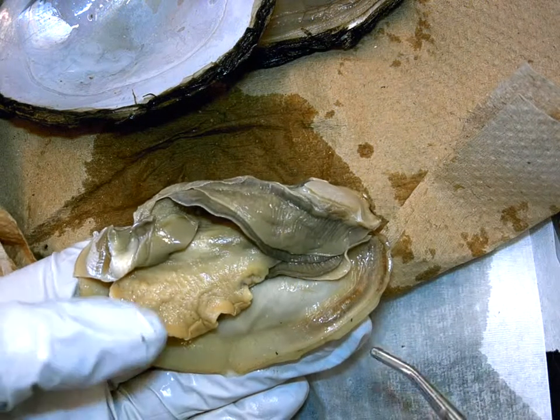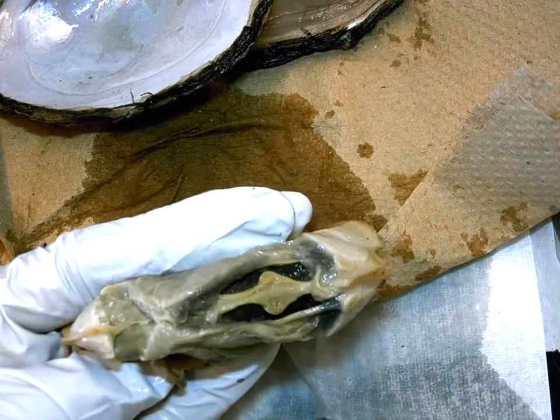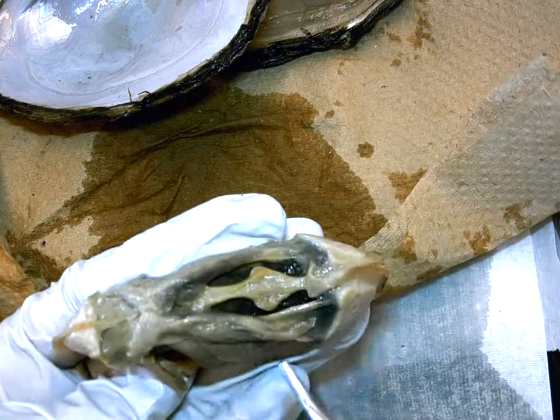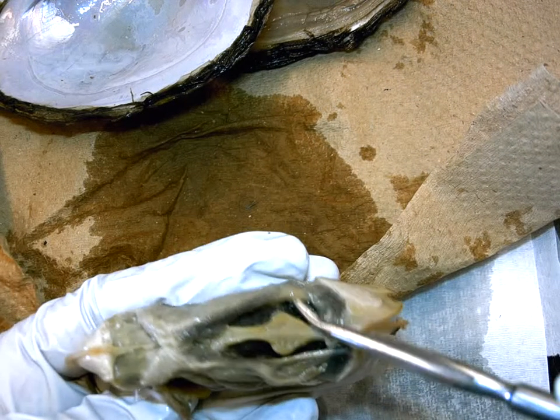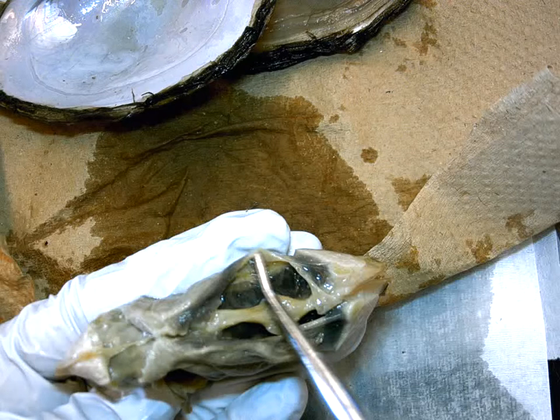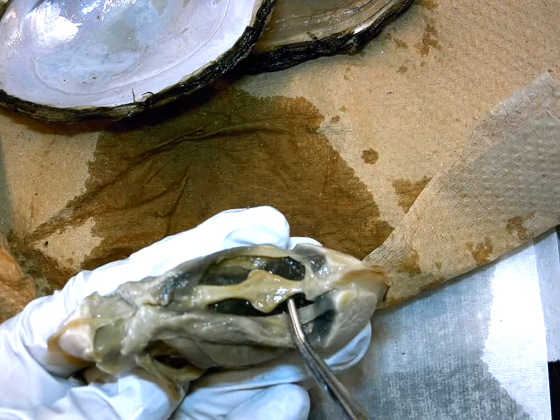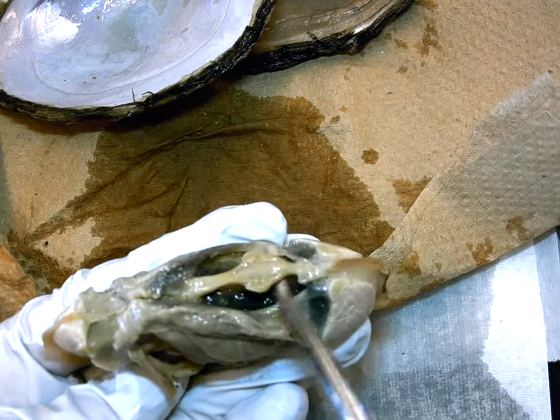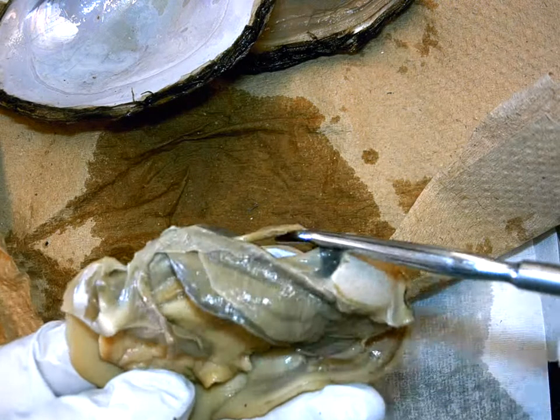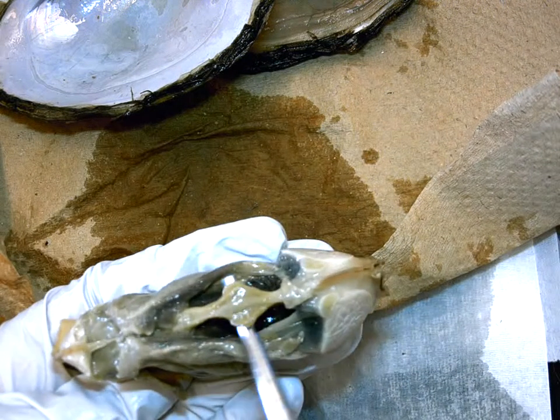The heart is in the dorsal midline, so I tilt the animal — this would be its dorsal side by the hinge. You'll see it sitting in what was a very thin tissue, kind of a tent of tissue surrounding the heart. Notice there's nothing on the front or side of it, which means the heart is freely sitting in this cavity.